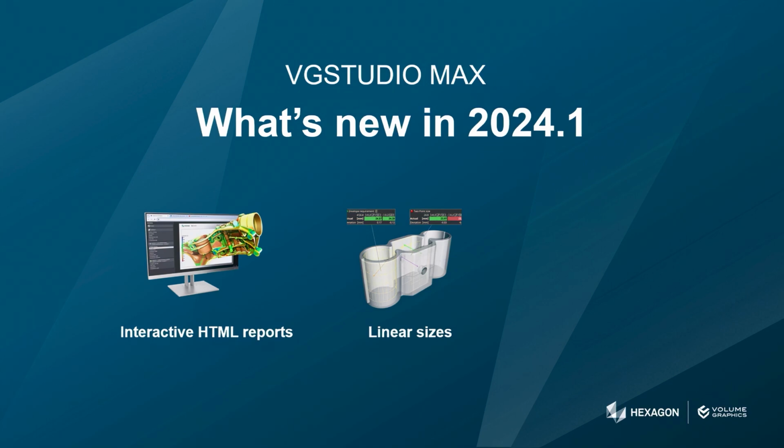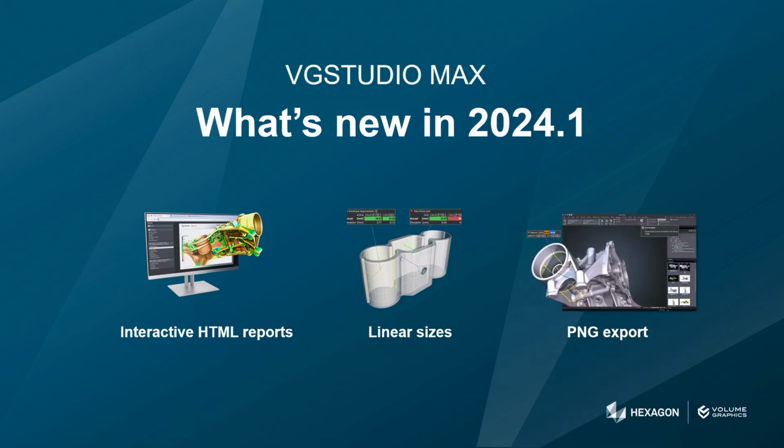And long awaited, but just in time for your next presentation, save images with transparency. No hacks, no workarounds. PNG export right out of the box. Ready? Then join me on a little tour of the feature highlights of our brand new 2024.1. Let's get started.